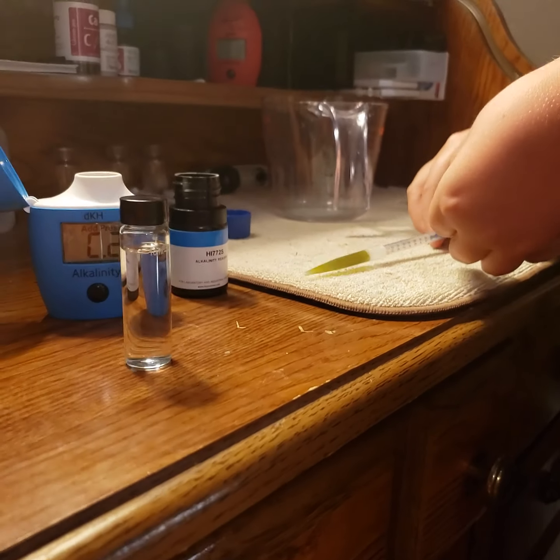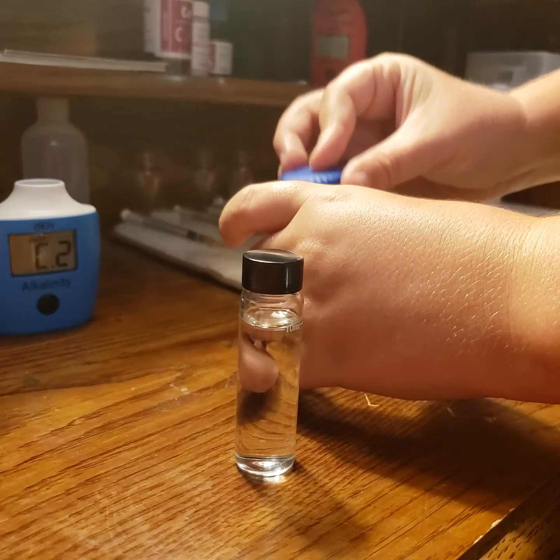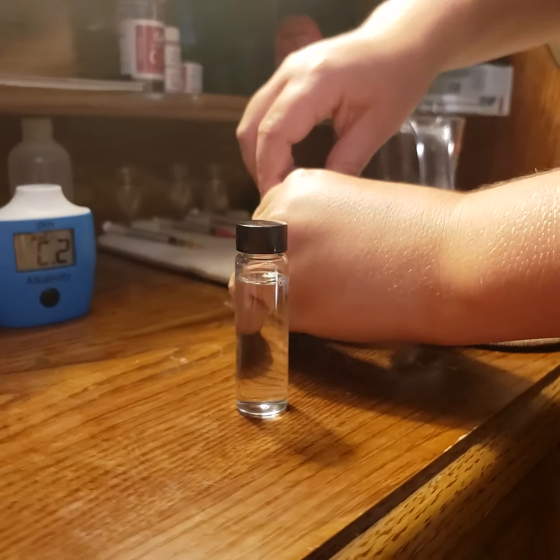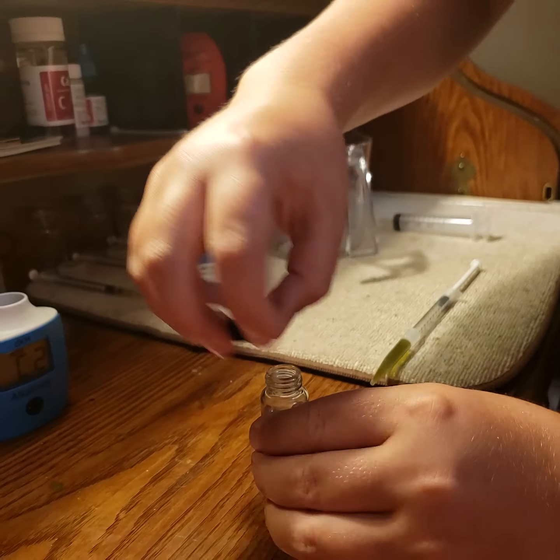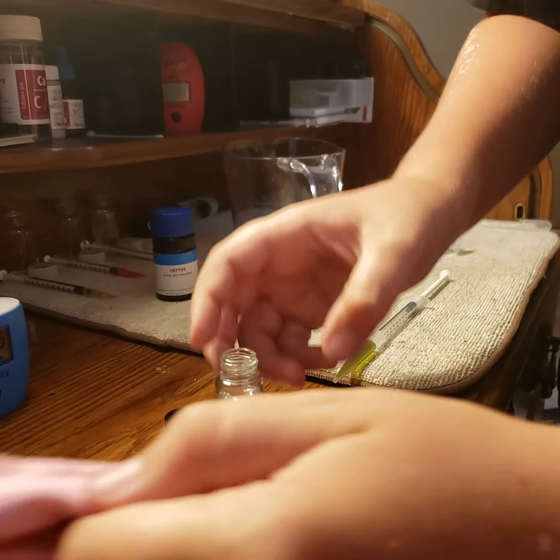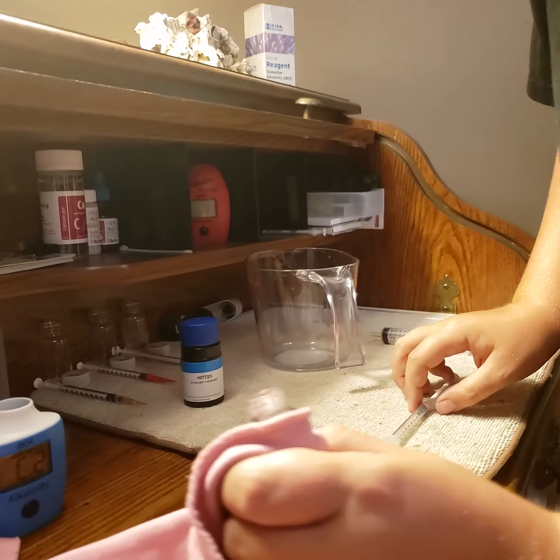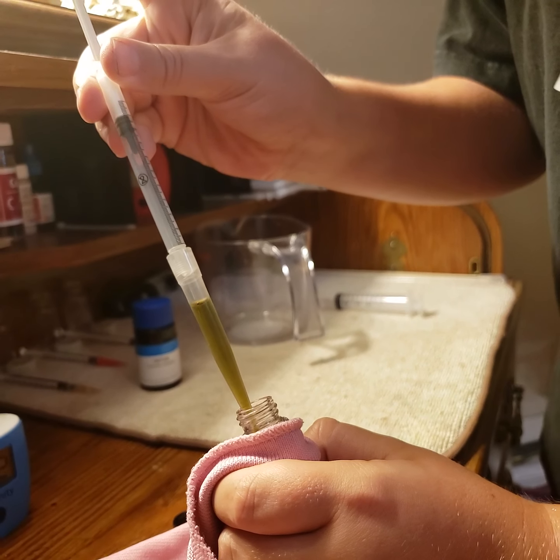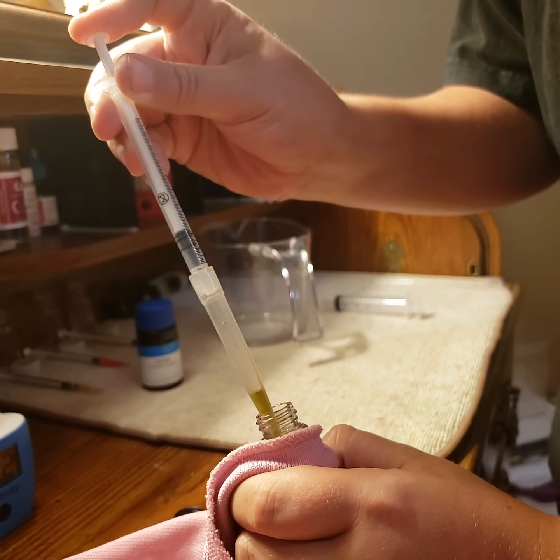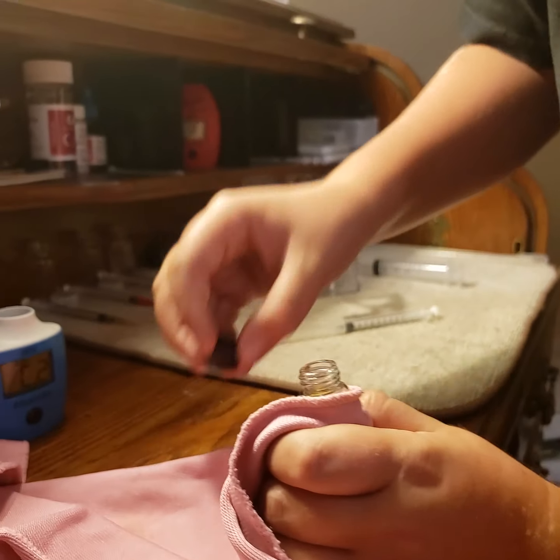Okay, so now he's gonna set that aside, put the cap back on the blue bottle, because we don't want to lose any of that. He'll open up the glass container and add that liquid to it. Don't worry about that. Okay, I see what you're doing. Sorry, buddy. He's doing this to avoid getting more fingerprints on it. He's gonna add the entire contents of the syringe. Good. Cap it.